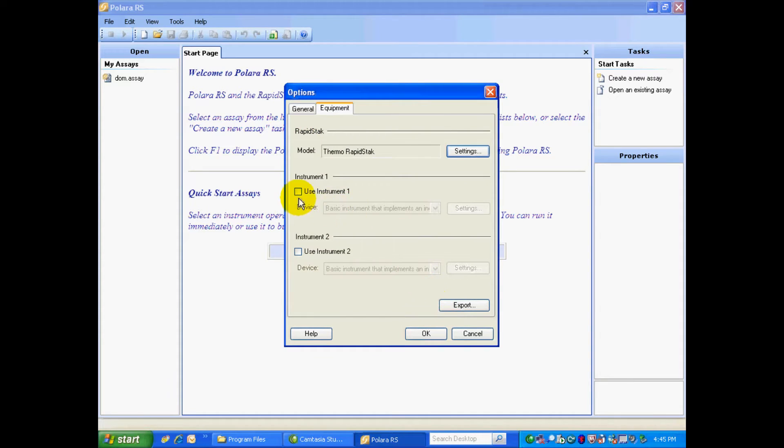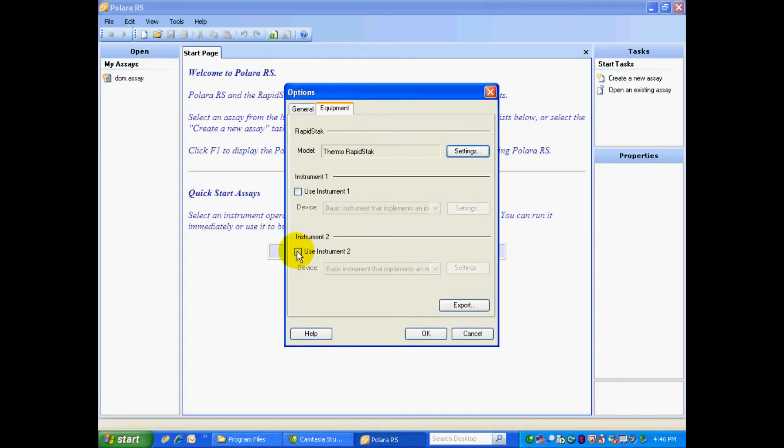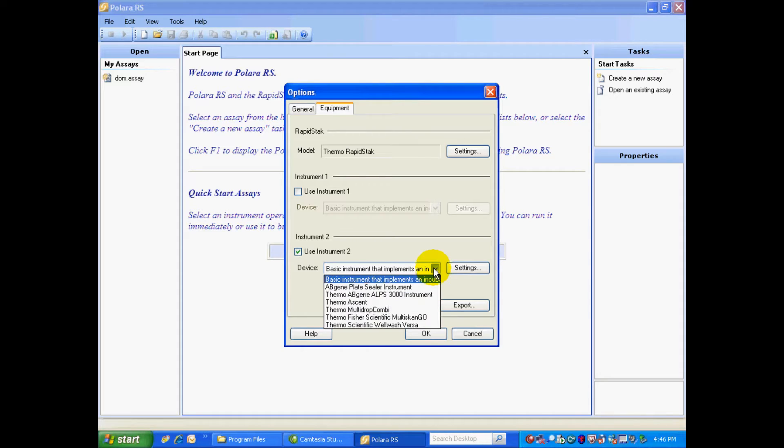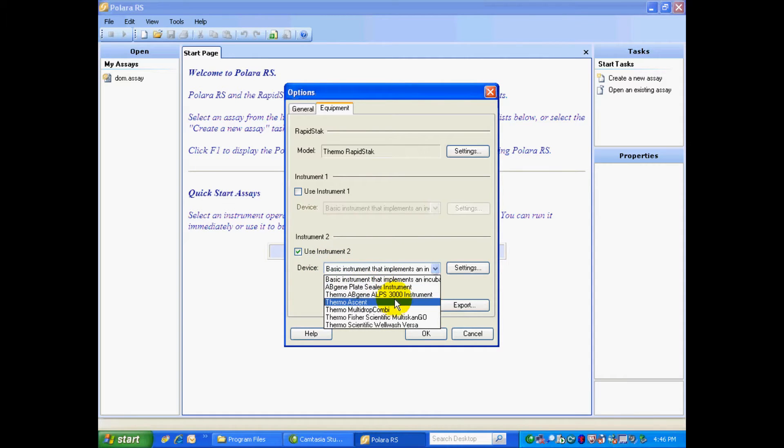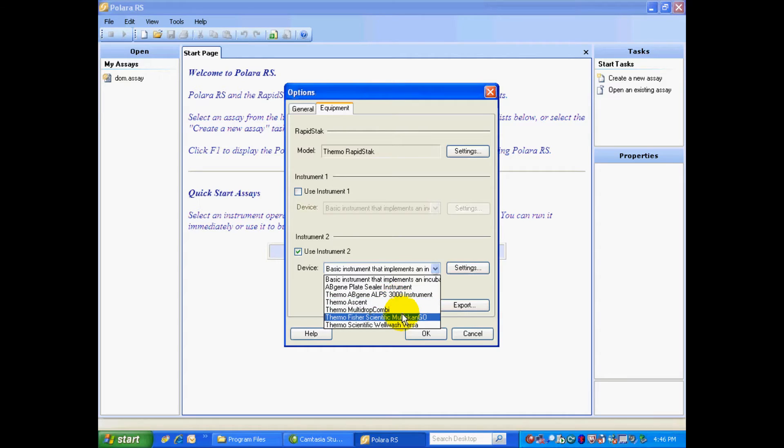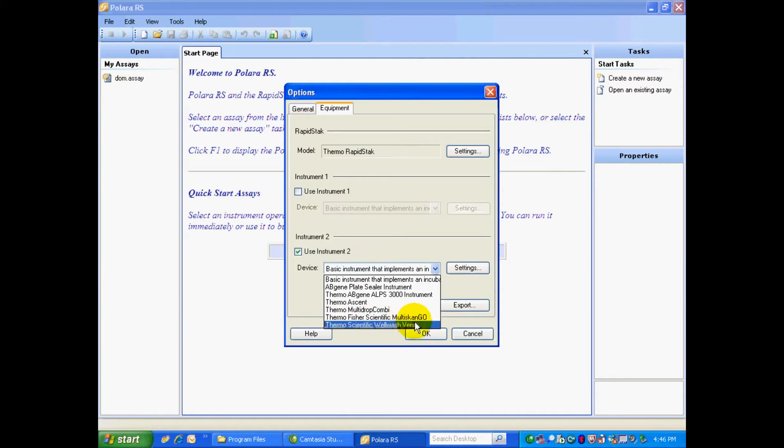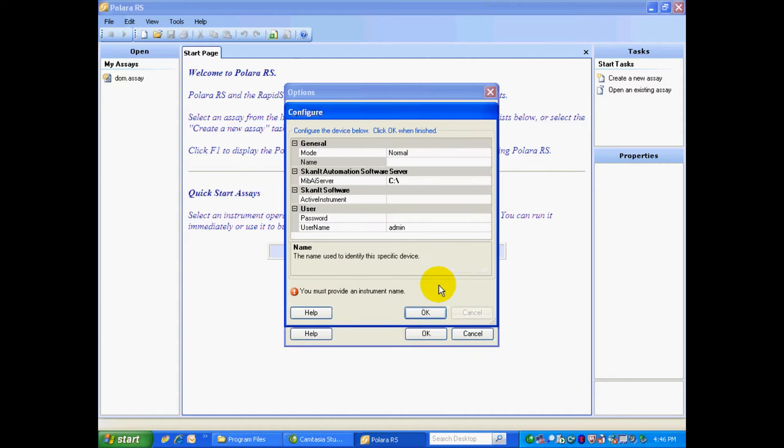Now we can select an instrument. My Multiscan Go is on the right-hand side of the Rapid Stack, and it's set up for Instrument 2. So I'm going to select Use Instrument 2. I click on the arrow in the device pull-down. And as you can see, I can select from a whole host of instruments. That's the nice thing about the Rapid Stack and Polara RS, as you can use a wide variety of instruments and swap out as you see fit. So right now we're going to select the Multiscan Go.